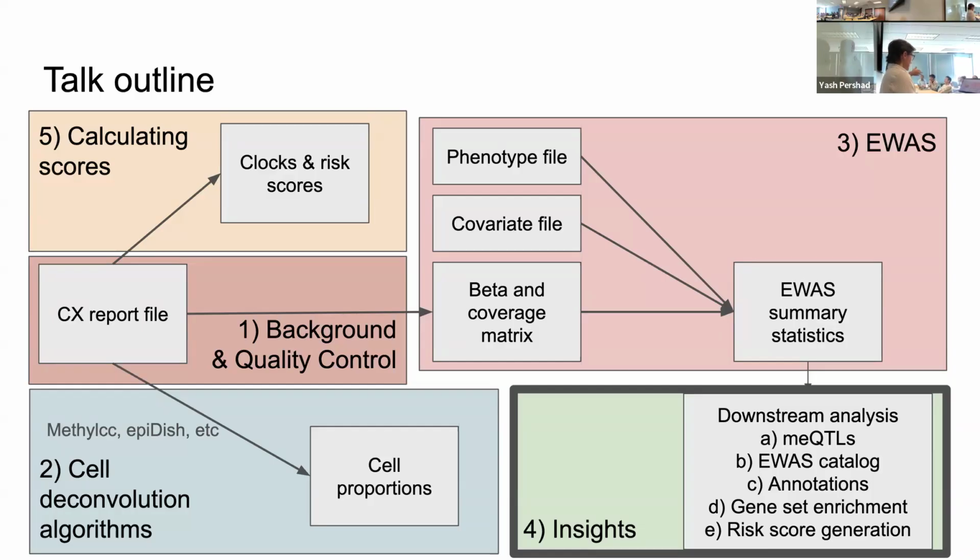You can falsely introduce missingness into your data by being too stringent in your filtering upstream, which I've made the mistake of doing before. Because it's sequencing, let's say you set a minimum coverage of 5x for every site. Every sample has to have 5x or more coverage at that site, and then 75% of them have to have 15x coverage at the site.